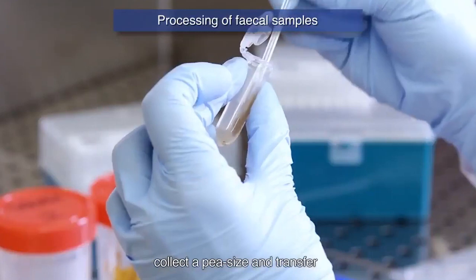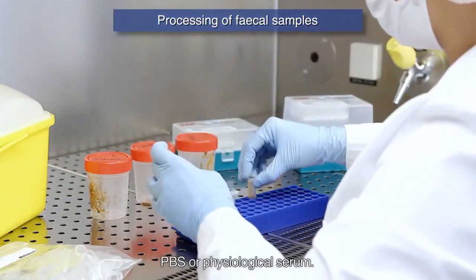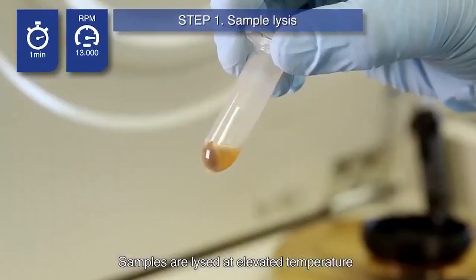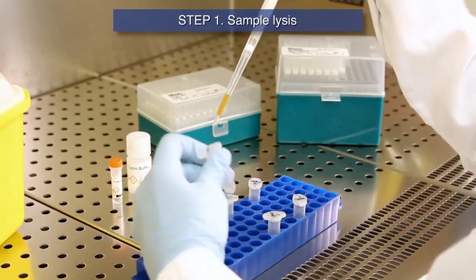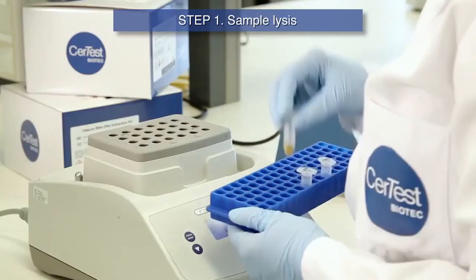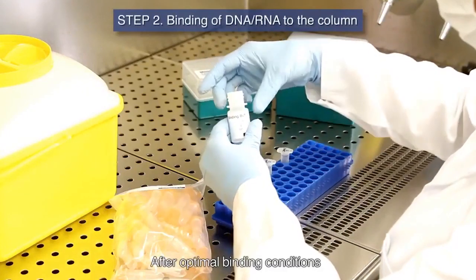Homogenize the fecal sample, collect a pea-size amount and transfer to a 2 ml vial with 200 microliters of RNase, DNase-free water, PBS, or physiological serum. Vortex the sample and centrifuge. Samples are lysed at elevated temperature in the presence of lysis buffer and proteinase K. Transfer the supernatant to the 2.0 ml collection tube. Then add lysis buffer and proteinase K and vortex vigorously. Incubate 10 minutes at 65 degrees and then 10 minutes at 95 degrees.